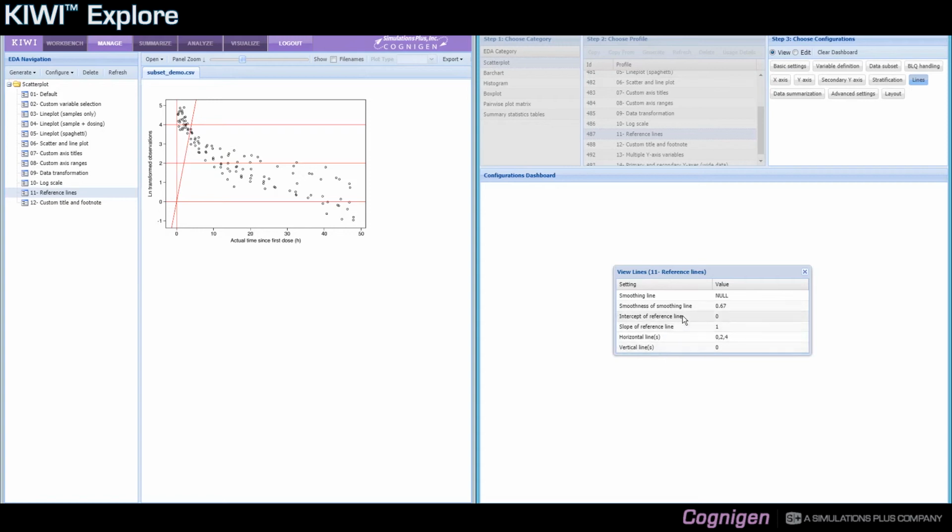The slanted line, you can only use a single slanted line, and you must provide an intercept and a slope. So in my case I used a unity line with an intercept of 0 and a slope of 1. The axes being non-squared or non-Cartesian, this line is showing a pretty steep slope, an apparent steep slope.